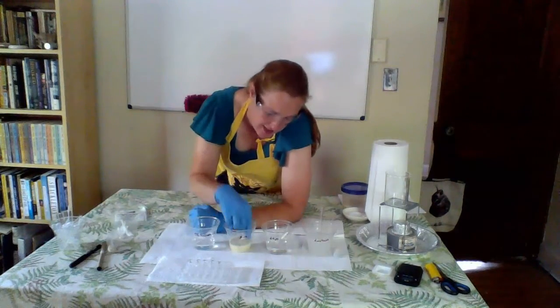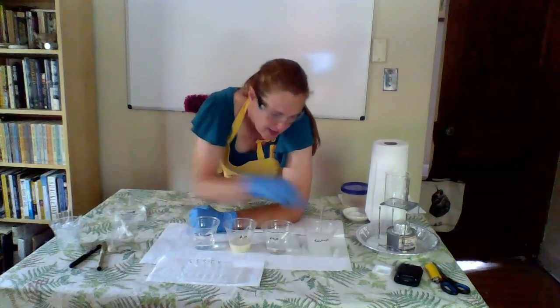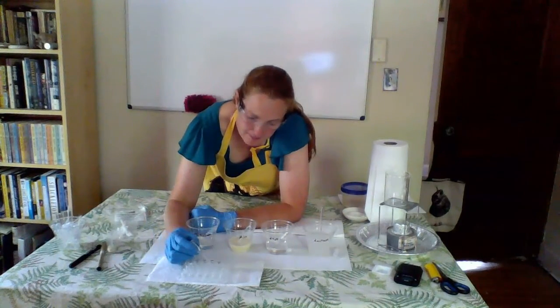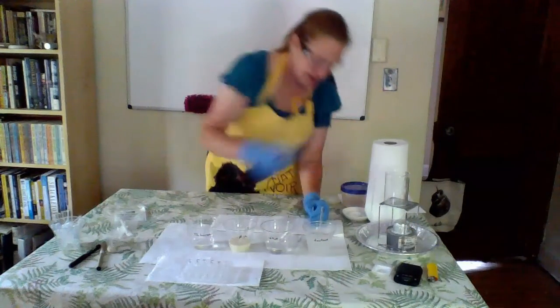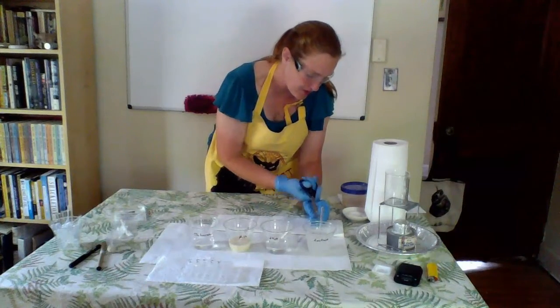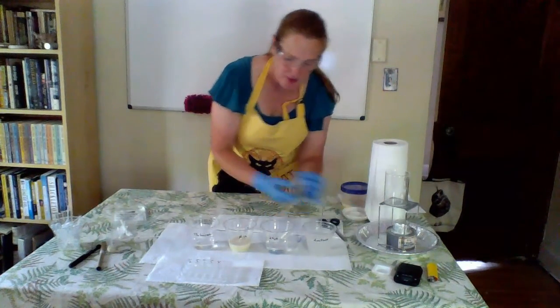Into D, I'm going to add 3 drops of milk and 3 drops of lactase. And then into well E, I'm going to add my 3 drops of very concentrated, or stronger concentration, glucose solution.